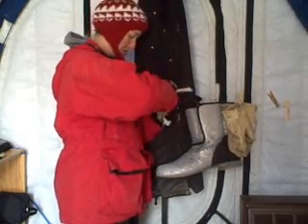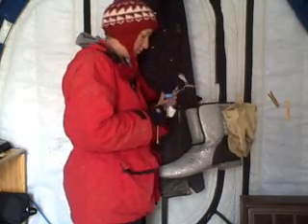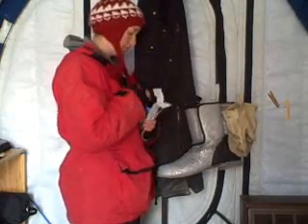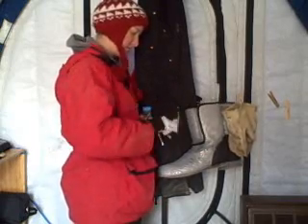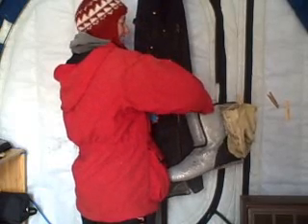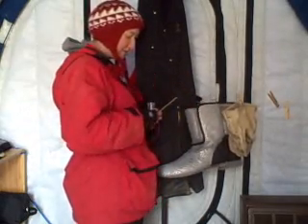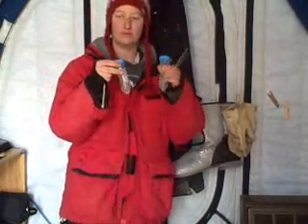There's one. But then we'll get the second one. Yeah, they're sweaty. Swish it around in there for a bit. Recap it. Now we got two boots ready to go.